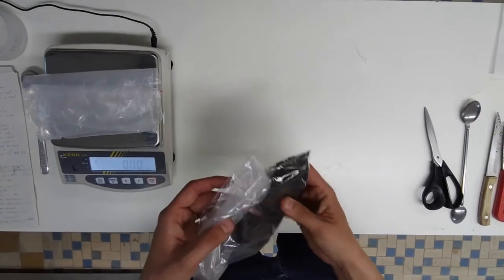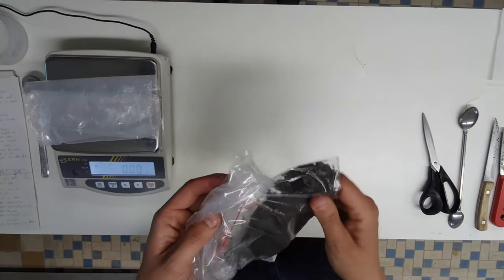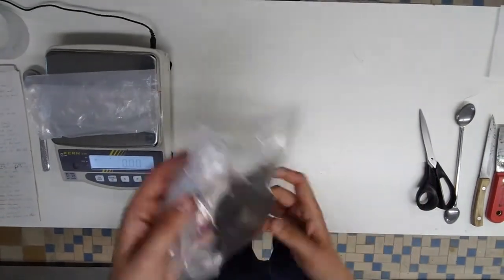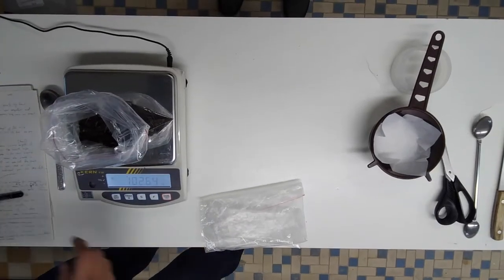First, we homogenize the soil and litter to destroy large aggregates. Do it carefully to not smash the animals inside. Second, we weight the entire sample and write down the result.